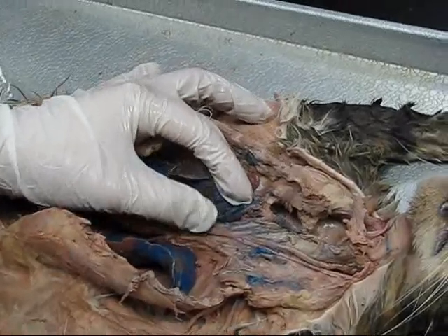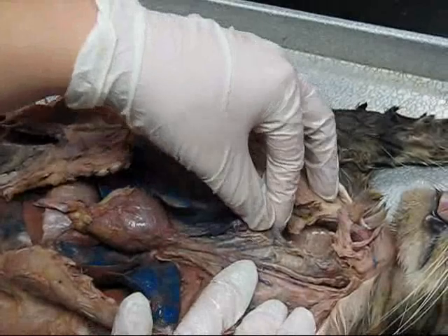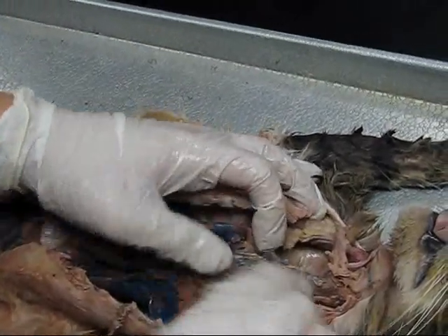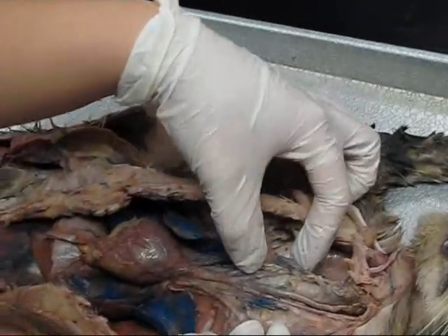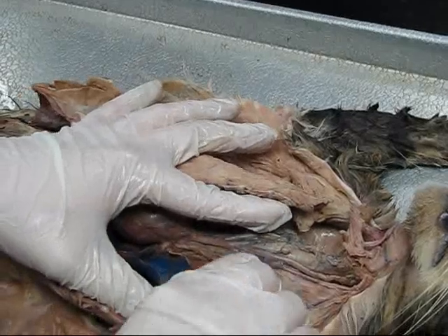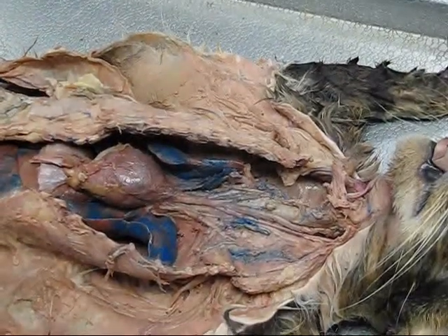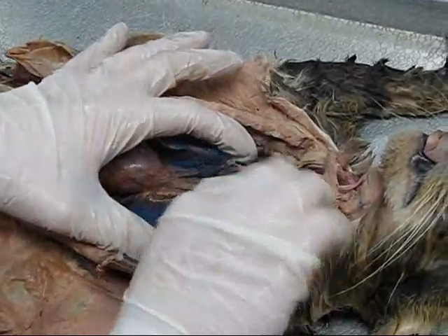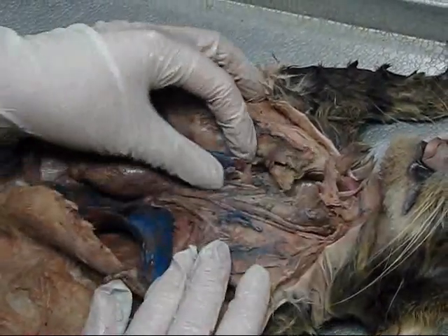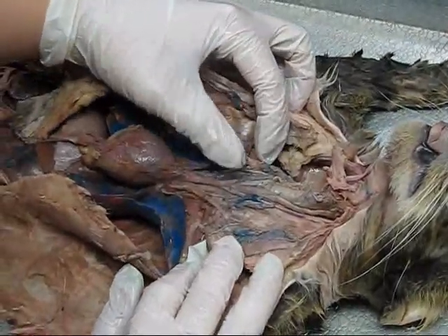Coming off the brachiocephalic, you have the common carotids, which come on either side of the trachea. You can see the one here coming up. Have you ever heard anybody talk about the carotid artery being in your neck? They come on either side of the trachea — here's one here, the other one comes through here. His left side is kind of cut up.